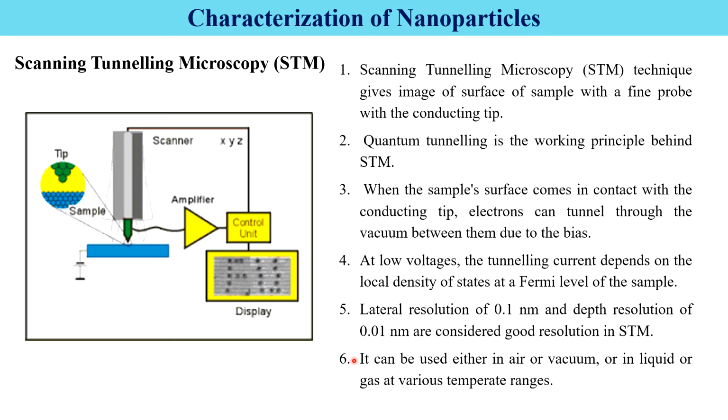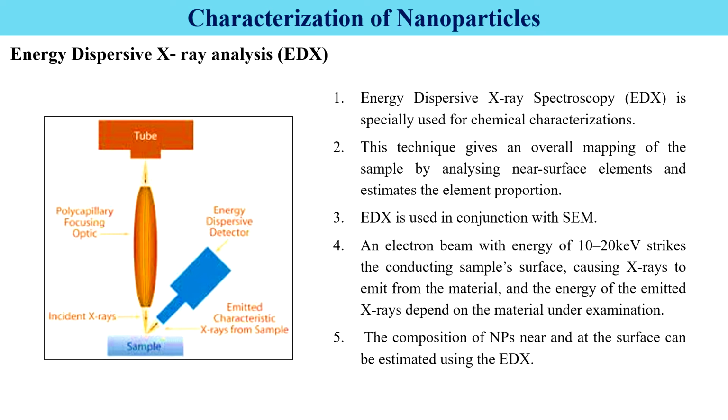This technique can be used either in air or vacuum or in liquid or gas at various temperature ranges. This is also a morphological technique. The next technique is energy dispersive X-ray analysis, that is EDX. Energy dispersive X-ray spectroscopy is specially used for chemical characterization.